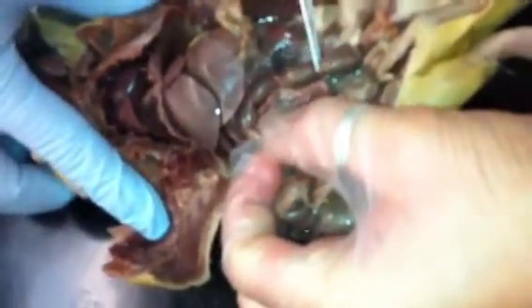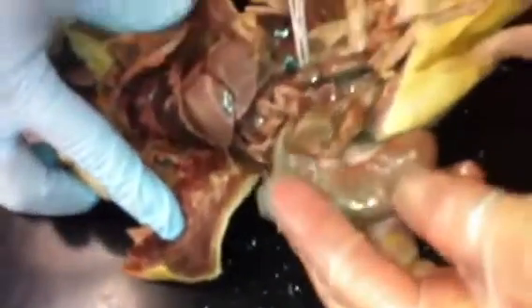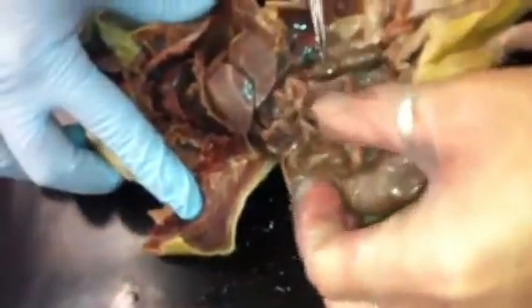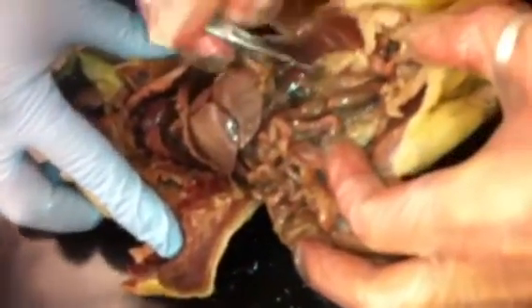So sometimes it can be hard to tell where to go next. So I'm actually going to go and move the intestines over, and I'd like you to see this is the large intestine here. Now it's a little bit smaller in diameter than the cecum, but it's still part of the large intestine. And if we look, the large intestine appears to be going straight down. So it's going to lead to the anus, which is underneath the scrotum here. So feces is going to be eliminated that way.